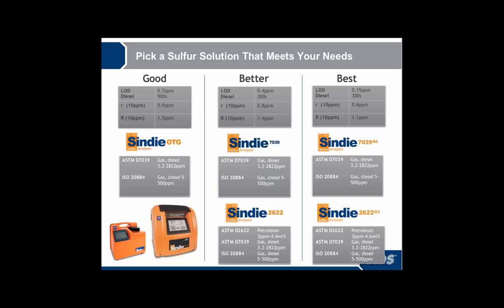And if you're not sure which analyzer you have, whether it's a Gen 2 or Gen 3, your Gen 2 analyzer is the analyzer that has a standard Chemplex XRF cup. And this analyzer will give you a limit of detection of 0.4 ppm for a 300-second measurement. And this analyzer is available as a 7039 analyzer or 2622 compliant.